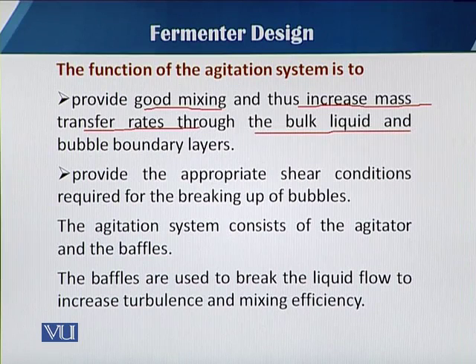When we talk about agitation, it provides an equal contact chance of the medium ingredients to the organism, or we can say the organism has an equal chance to go anywhere in the fermenter vessel, having the chance of utilization of the fermentation components, ingredients or nutrients.